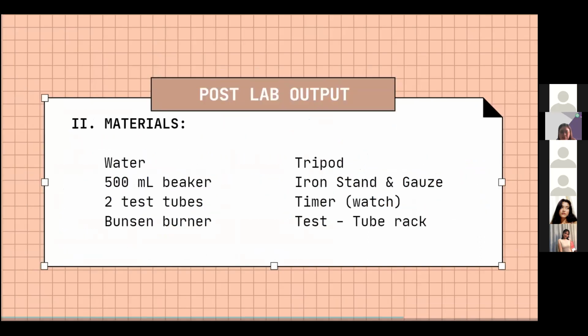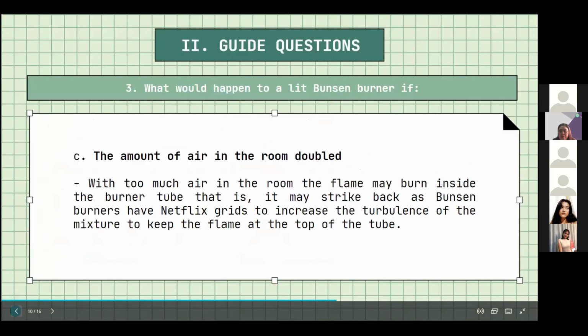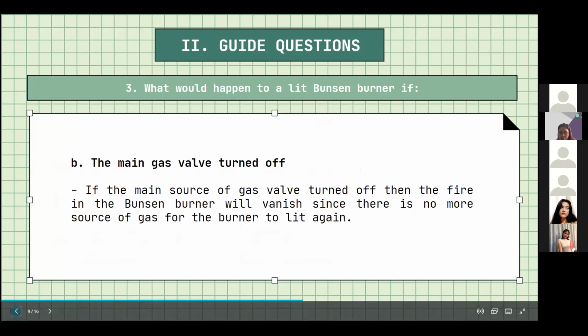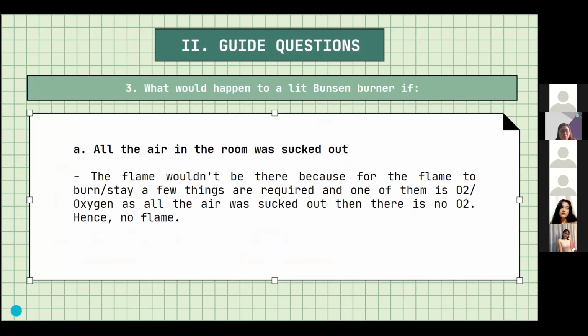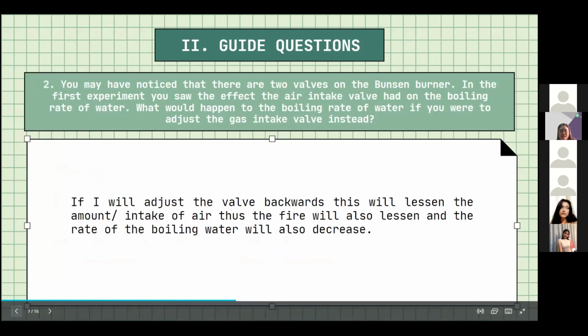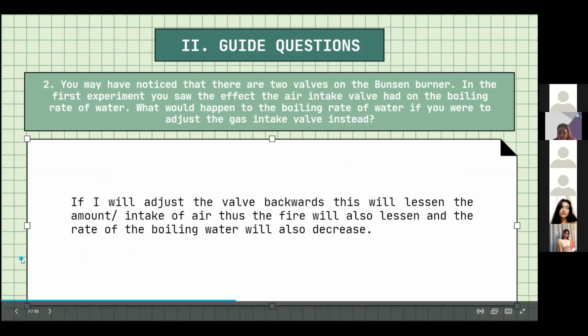Ayan, so this activity is about the Bunsen burner. This is experiment number 1 because supposedly we are going to conduct this one inside the laboratory. But since our situation now does not permit us to do an actual experiment, let us just discuss important things about the Bunsen burner.